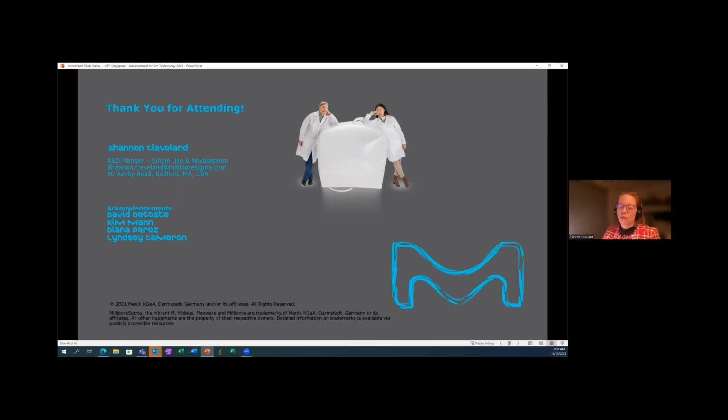Clinton asked, can you comment on the type of integrity test that is performed on the new bags? Yes. So we validated an air integrity test. It's similar to our other air integrity tests where we fill the bag with air to a certain pressure, and we look for pressure decay that indicates a leak of, I believe it's 1 to 2 microns. It's very similar to our current product specifications.